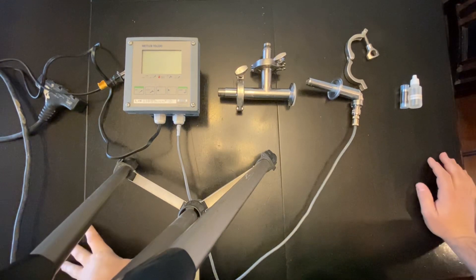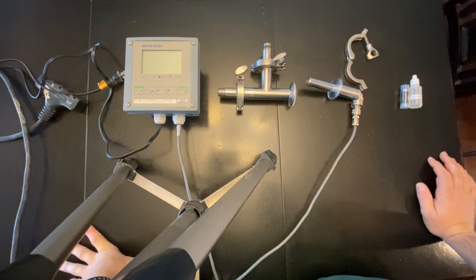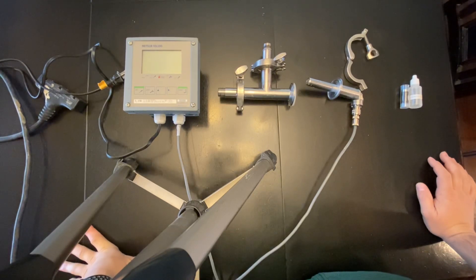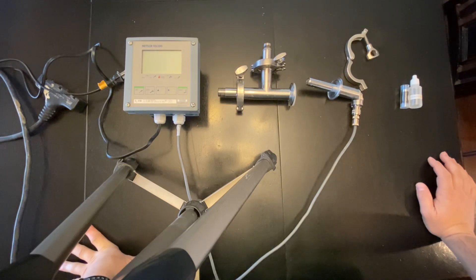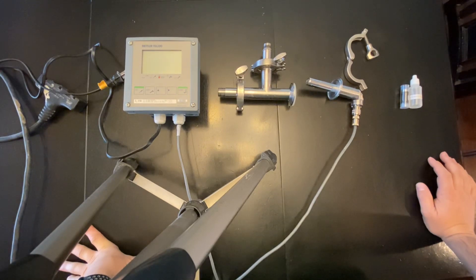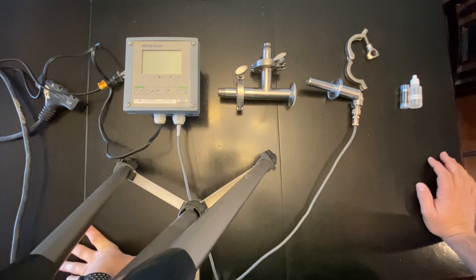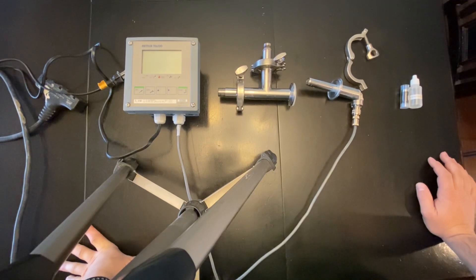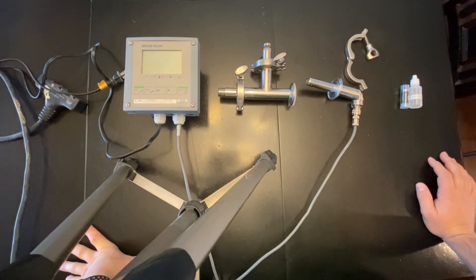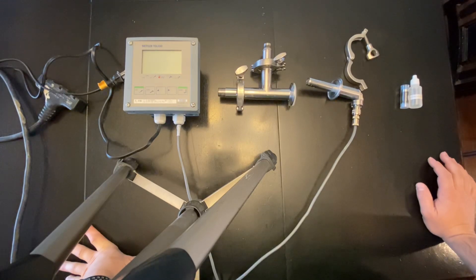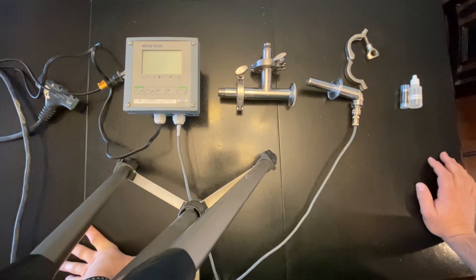Alright guys, here's the Modern Brewhouse community in-process professional DO meter that you can use for any in-process measurements, whether it be hot liquor tank deoxygenation, mash DO, boil DO, finished after boil DO and oxygenation, or finished beer.